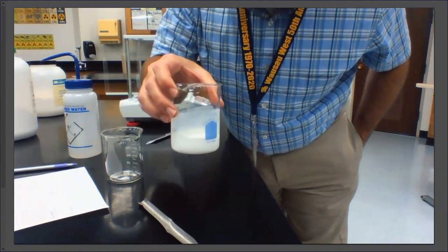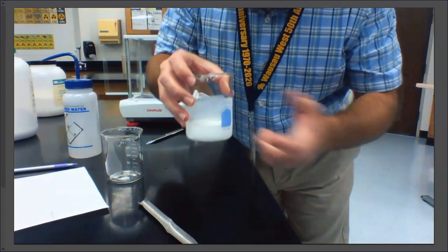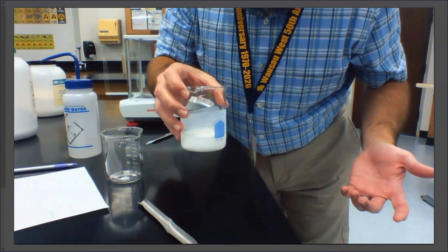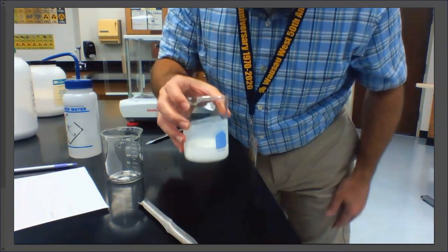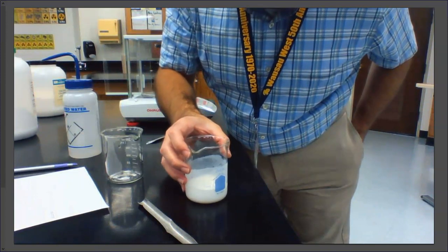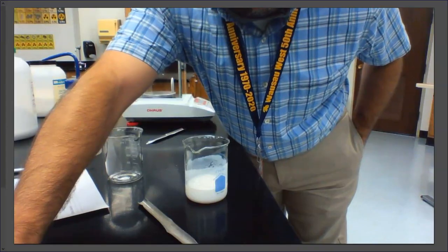Now, the next step is we need to filter this. We want to capture or collect what was formed, the solid stuff. But I don't want all of that water or the other chemicals that are still left over in my solution. So I'm going to set up my filtering apparatus and show you guys that in just a little bit.